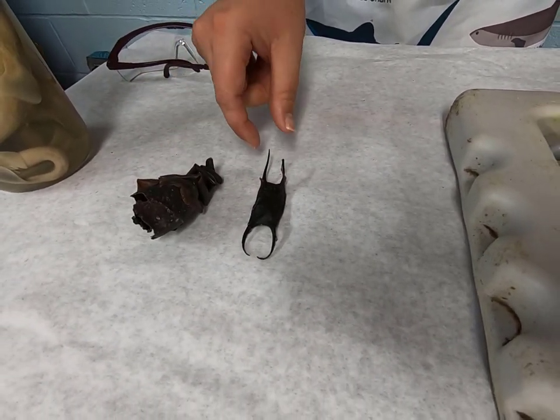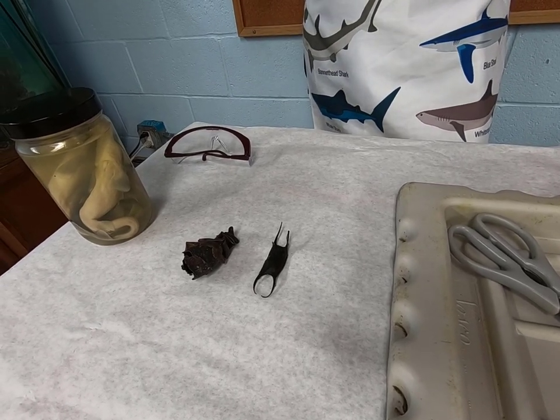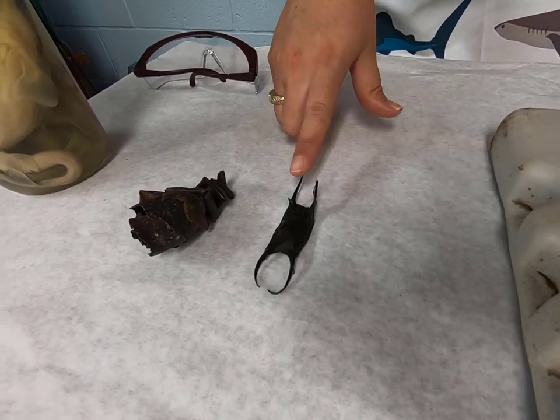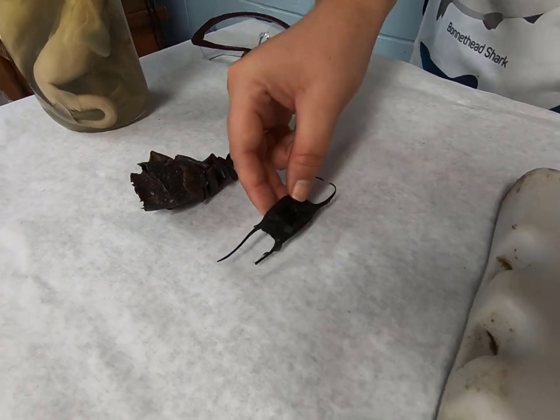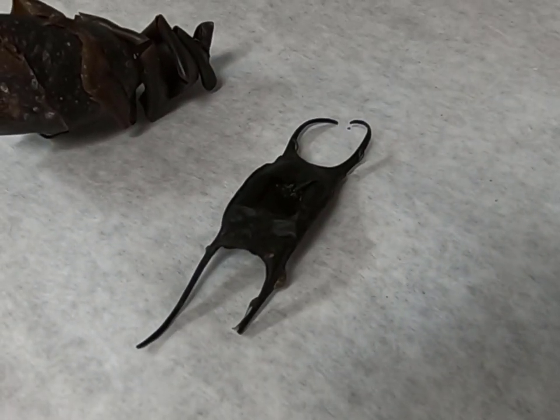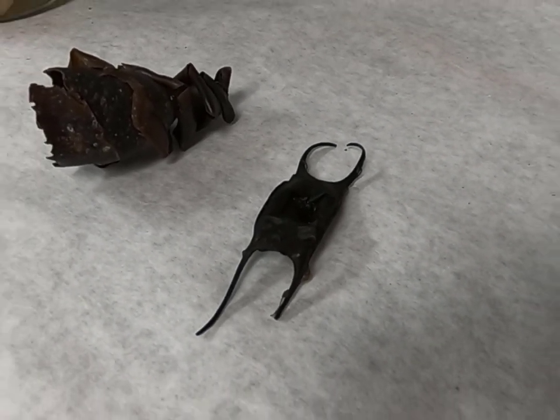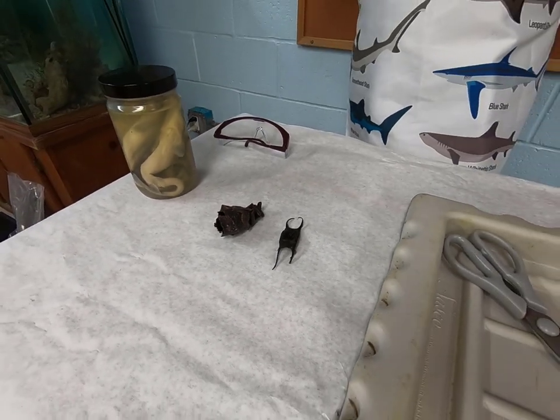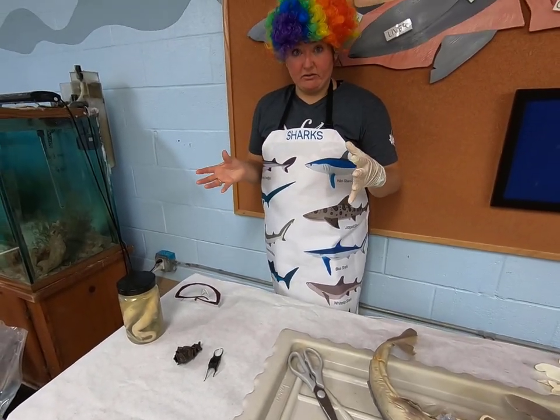Sharks, stingrays, and skates are all in the same class, chondrichthyes, which means cartilaginous fish. So these skates have these egg sacs as well. And so they actually will expel, you can see the hole right here. The baby has left the shark egg casing. And so the mama shark will lay these eggs. They'll go down to the bottom. They'll blend in with the algae and seagrasses and things that they can disguise themselves in.